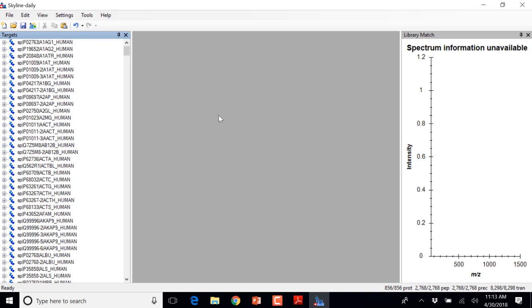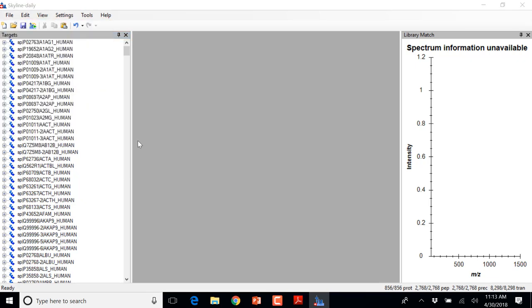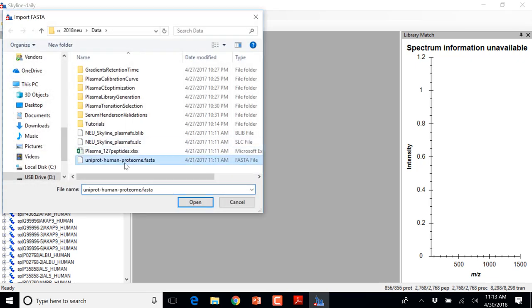Yes? I have a question, Susan. What was the FASTA recording again? Uniprot. It's right. Human proteome. It's the one that was right here. Hold on. Is it the same FASTA? This one? Yep. Okay. Good.